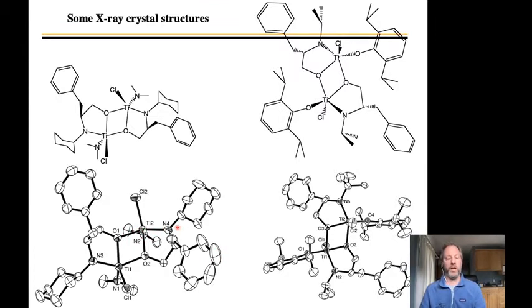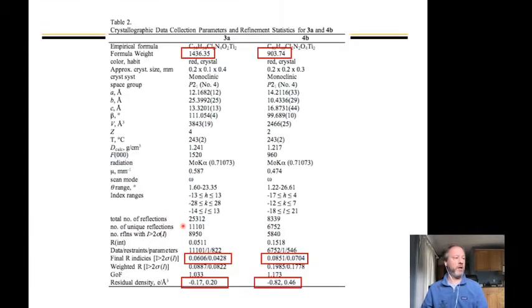So the size and magnitude of these ellipsoids is important, but connectivity, the lines, are just drawn in by the program. We've talked a lot about what a line means in Chem 104 this year, and we normally think a line is 2 electrons in a bond, but I hope that I've dissuaded you of that; sometimes it's not. Sometimes it's more complicated than that. And there are certainly additional electrons, not in this case in titanium, but if this was an iron, there are other electrons on the iron that are not showing up as bonds, like the d electrons. So that's the picture. How can we then evaluate the crystal structure?